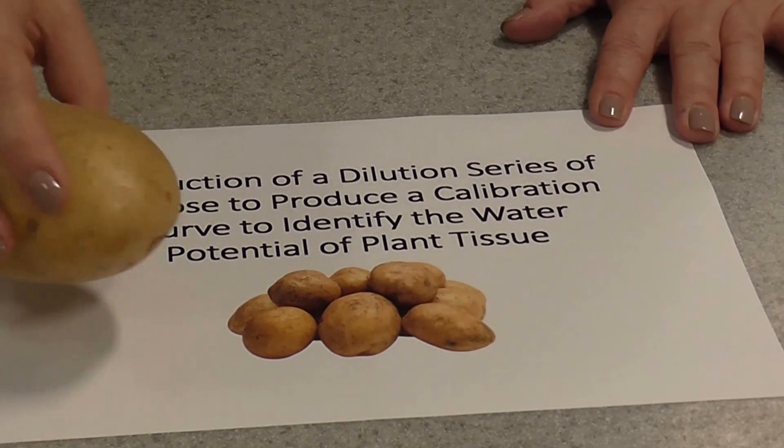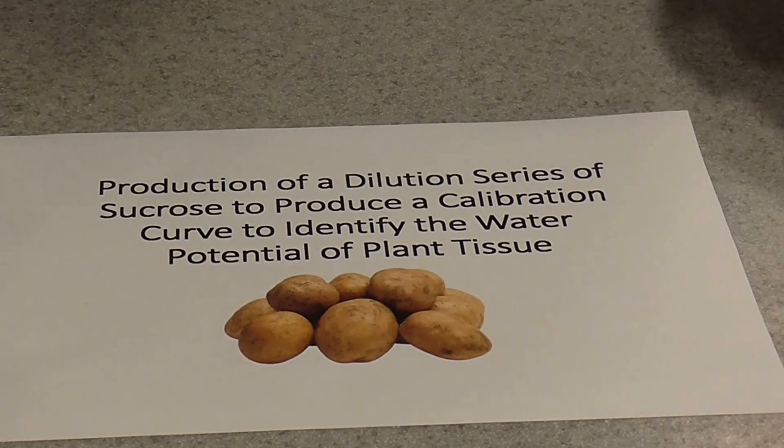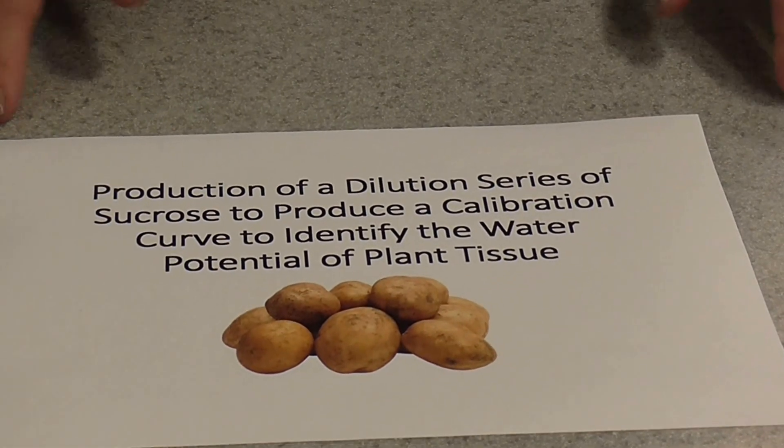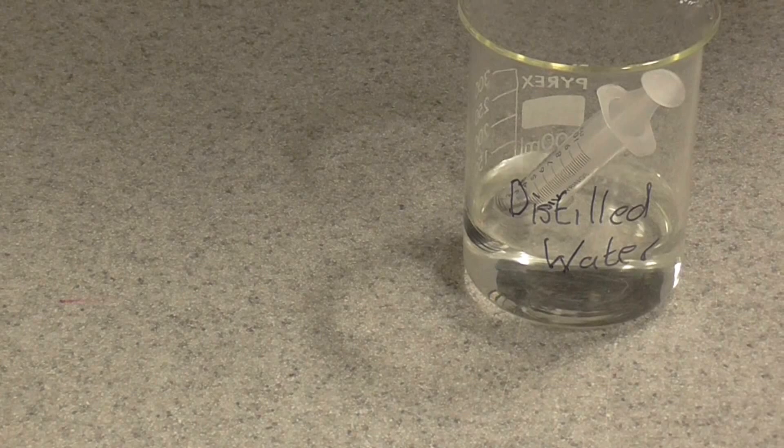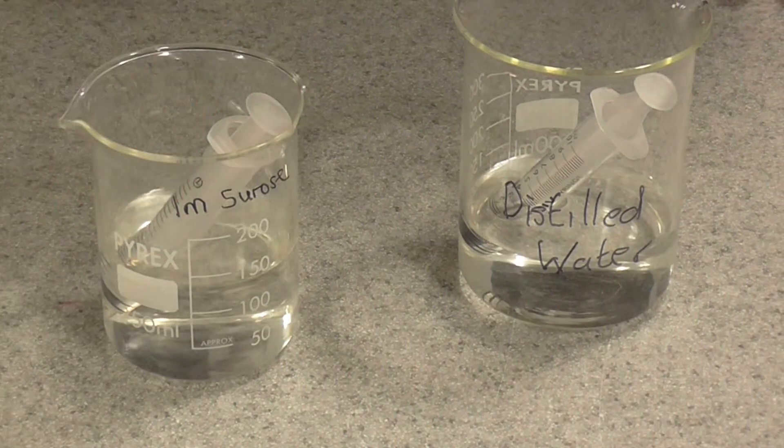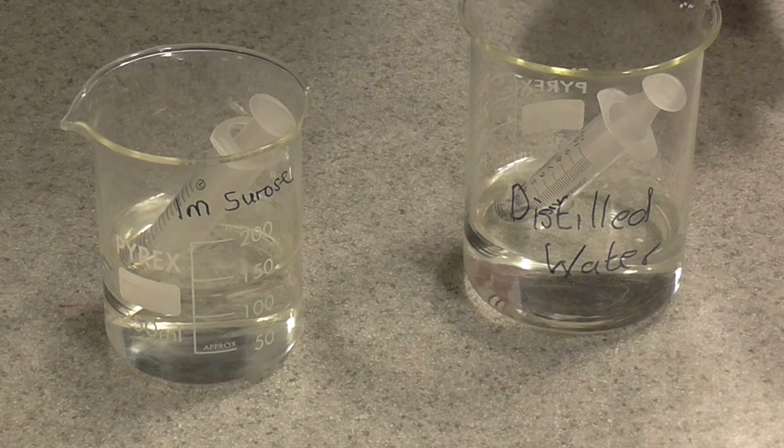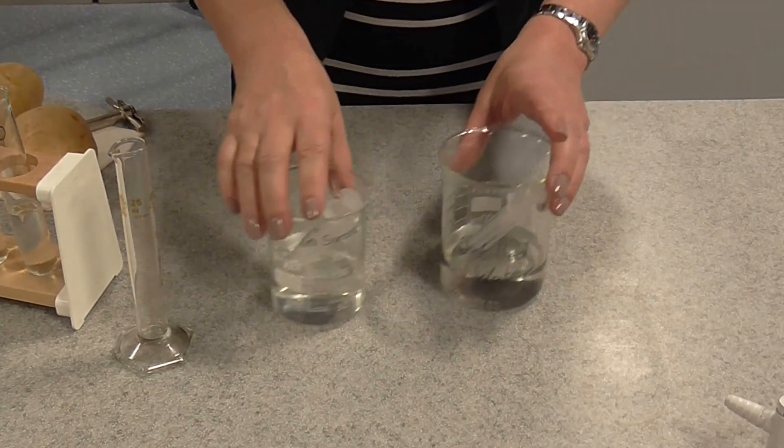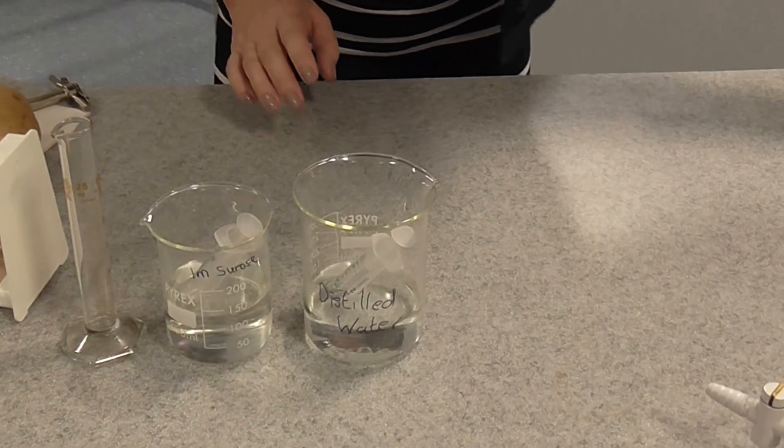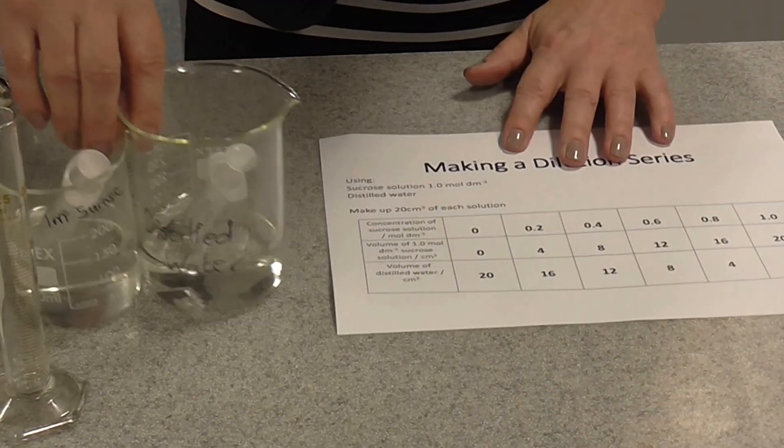The plant tissue we're going to use to do this is going to be potato. The first thing we need to do is actually make our dilution series. For this we need distilled water and we need a one mole per decimetre cubed sucrose solution which the technician has prepared. You can use measuring cylinders for this or you can use 10 centimetre cubed syringes. We're going to make up 20 centimetres cubed of each of a number of different solutions.